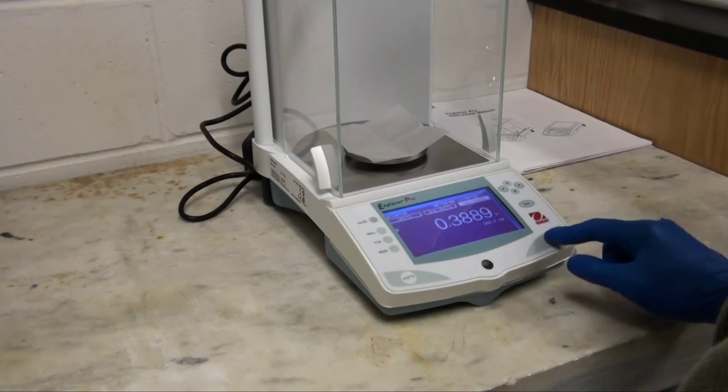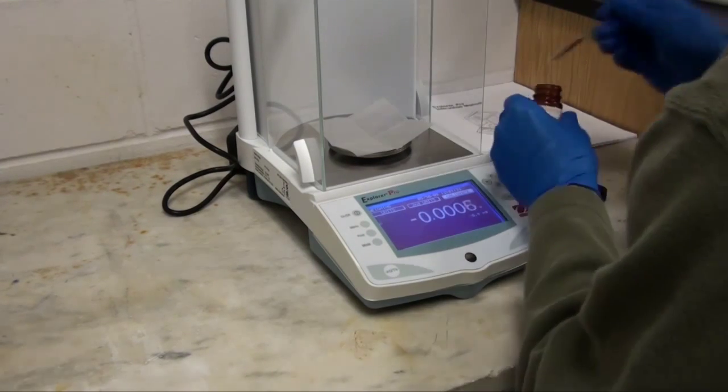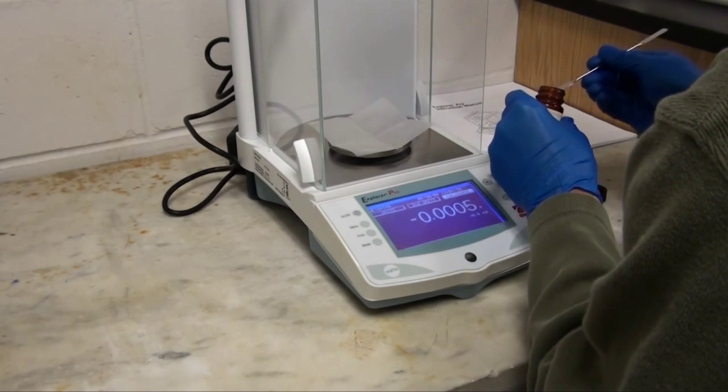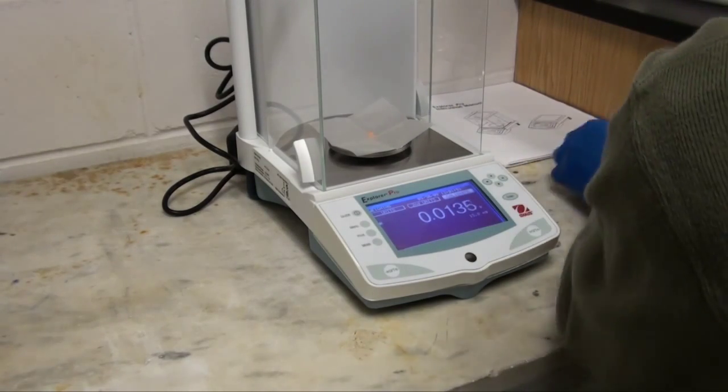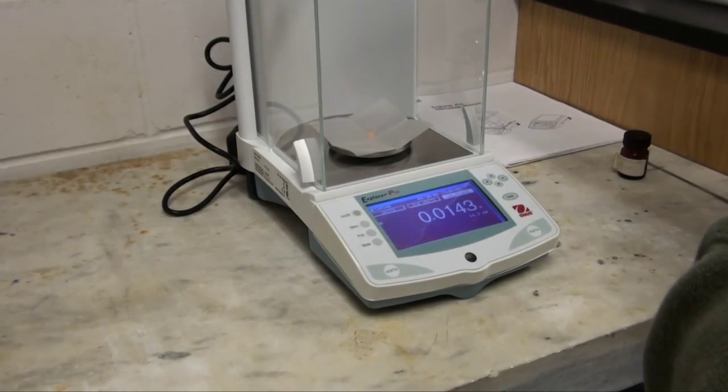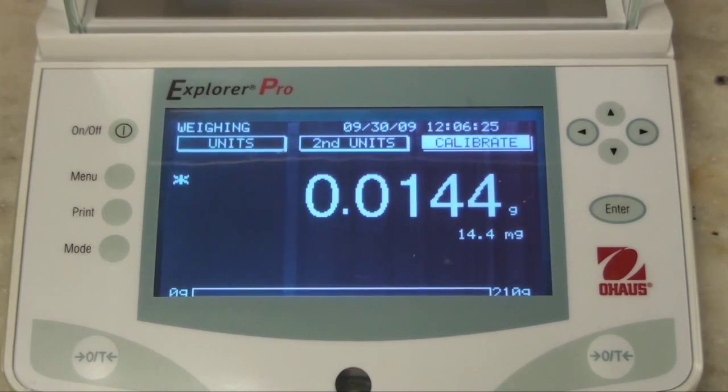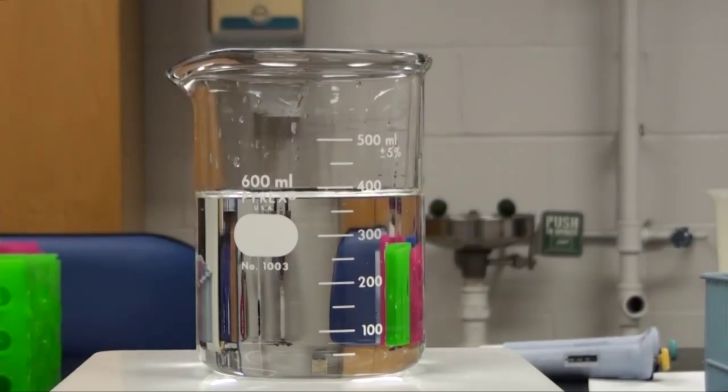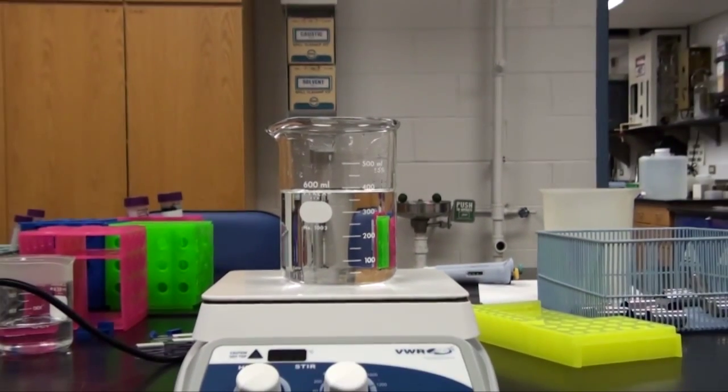What I'm showing you first is using an analytical balance to measure a small mass of a chemical by the name of bromphenol blue. This is commonly used in molecular biology labs as a chemical indicator or a dye to monitor electrophoresis in a DNA loading buffer.